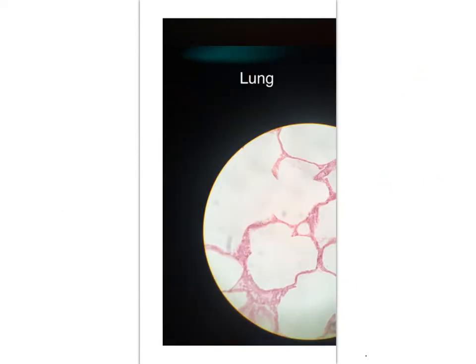Okay, the third slide here represents lung tissue here. Now, everything that you see that is pink, so literally all the pink outlining here, this is going to represent what we call simple squamous epithelial. So I'll just label it here. So everything that is pink, you can't go wrong with this, represents simple squamous epithelial tissue. Okay. Now, in regards to the other 2 structures that you need to be able to identify, that is simple squamous epithelial, but the other 2 are going to be alveolus and a capillary.